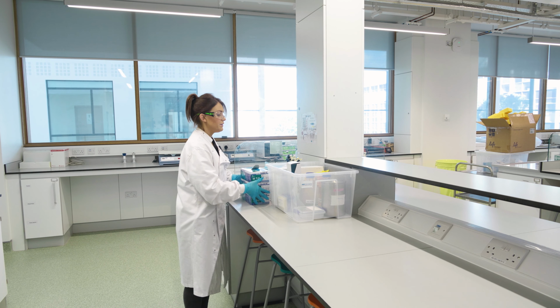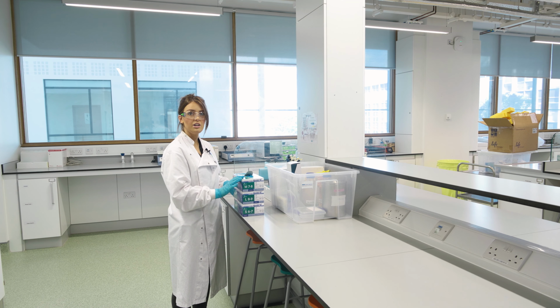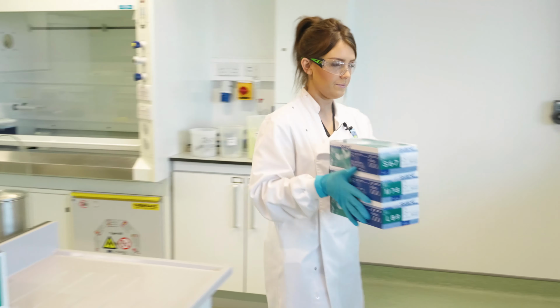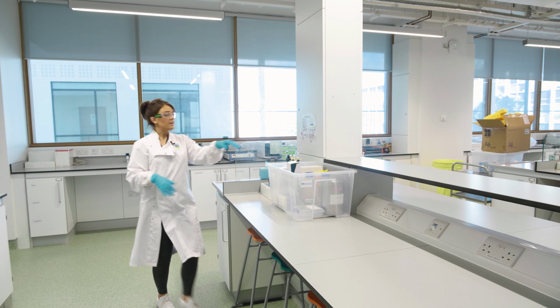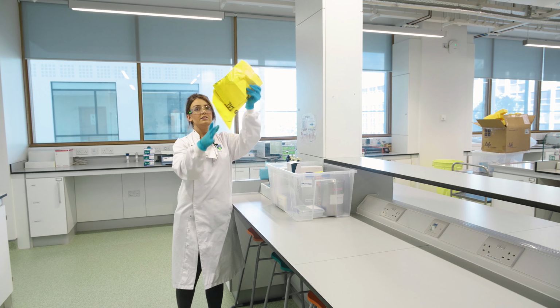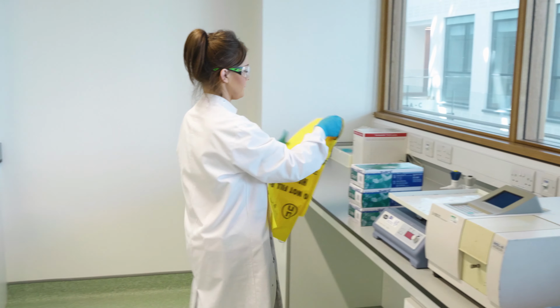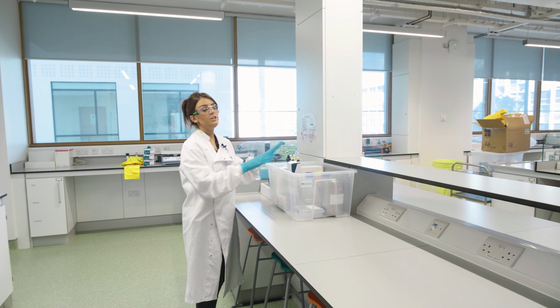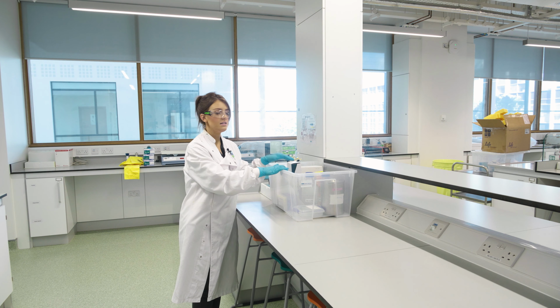So the first thing you'll notice is there's 3 sizes of gloves in your kit, the small, medium and large. To make it easier for everyone in the class, you should leave these at your bench. As well as the gloves, we've also given you a bin bag to put them in, so you should also leave this at the top of your bench. So only the gloves can go in that bin bag. You'll get a separate bag for your gels when you're finished the gel electrophoresis.